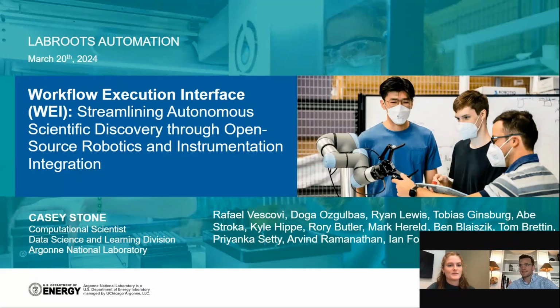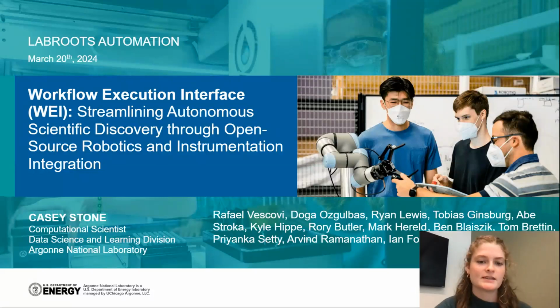Hi, everyone. Thank you, Nick, for the introduction. So as Nick said, I am a computational scientist at Argonne National Lab. I do a lot of work in many projects at Argonne, but the one I'll be talking about today is a software stack that me and my group at the Rapid Prototyping Lab have developed called the Workflow Execution Interface, or WEI for short, which is just a software stack that allows us to more easily integrate different pieces of robotics and pull in AI and pull in data management so that we can hook AI and robotic labs together to do science in an autonomous way.